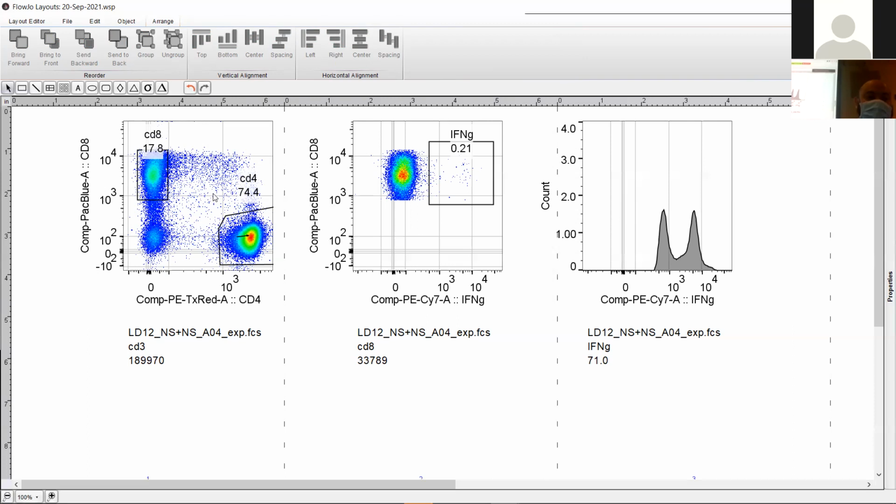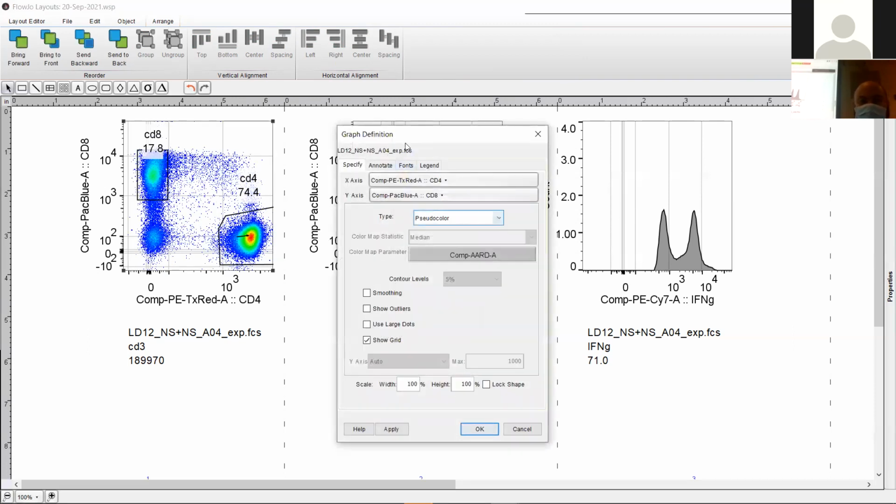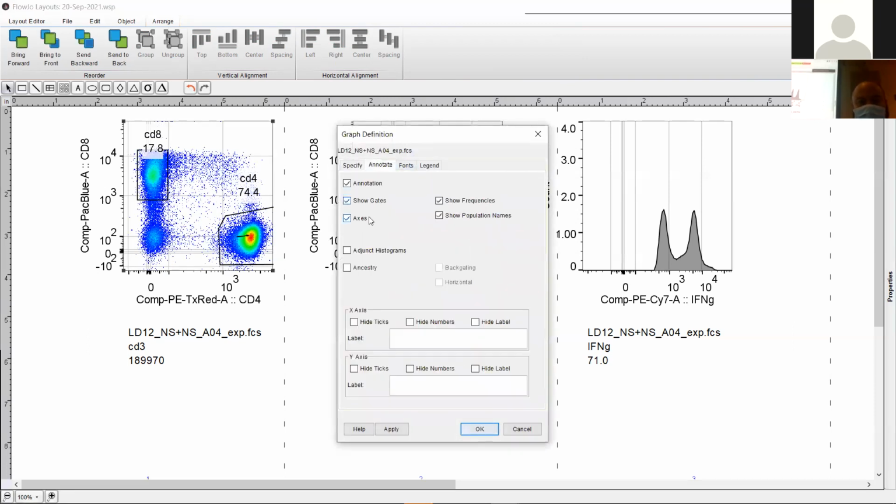to meet those criteria. Double click on it, click on annotate. On the label, for x-axis, I'm going to put CD4, CD8. This is also very useful if you're going to go to a conference and you have discovered a new parameter, a new biomarker, or you're working with a compound you're not ready to release yet, you could label it as X, okay?